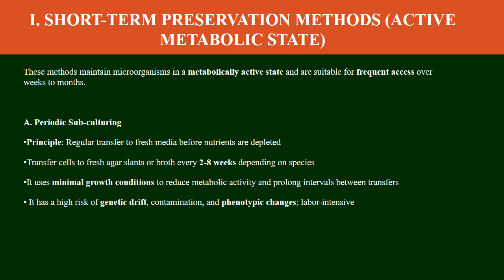The first one is short-term preservation method, which is an active metabolic state. These methods maintain microorganisms in a metabolically active state and are suitable for frequent access over weeks to months. The first is periodic subculturing.